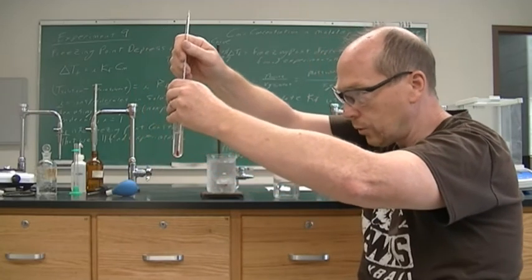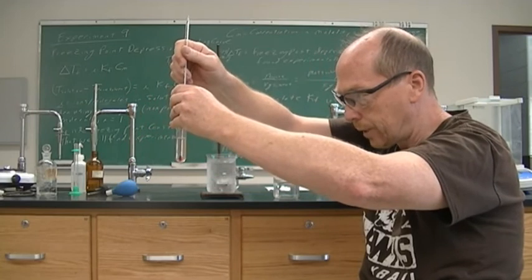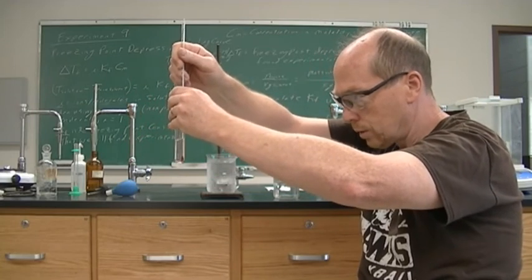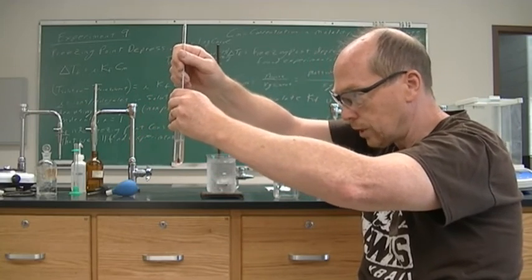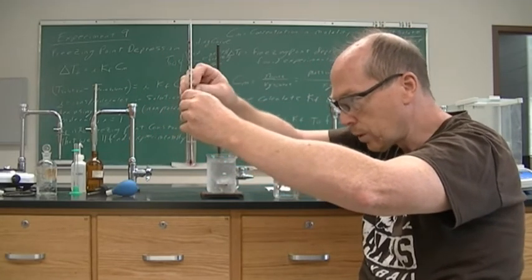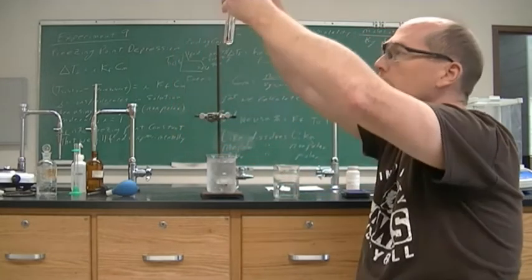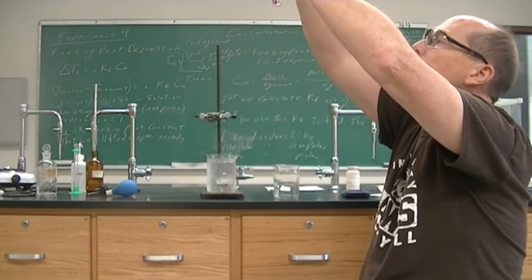The unknown is a non-polar organic compound. So like dissolves like, both organics, both non-polar, and it will dissolve.